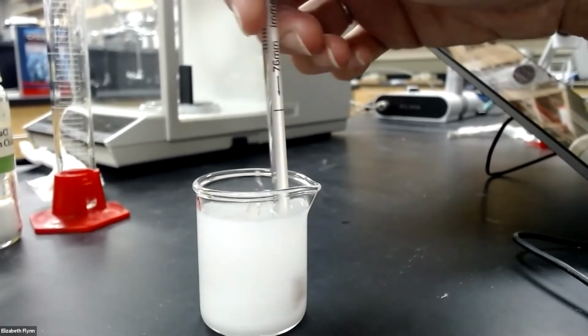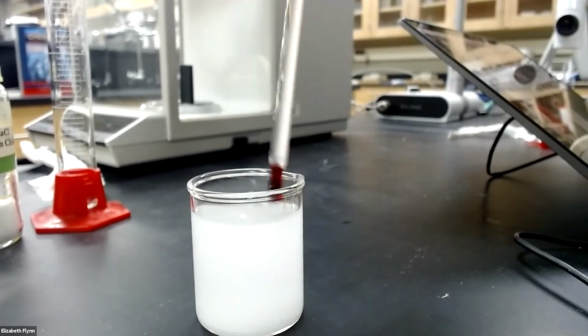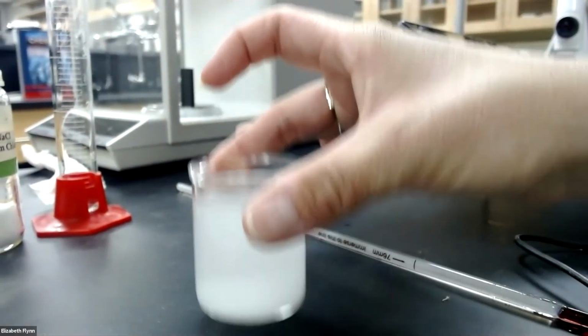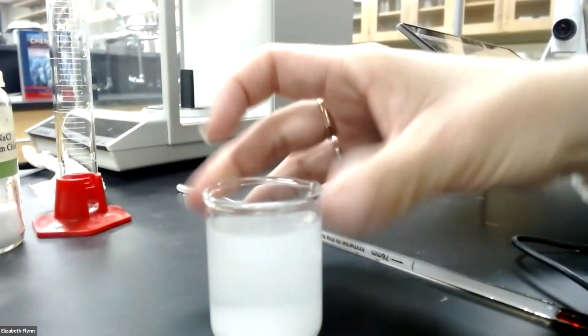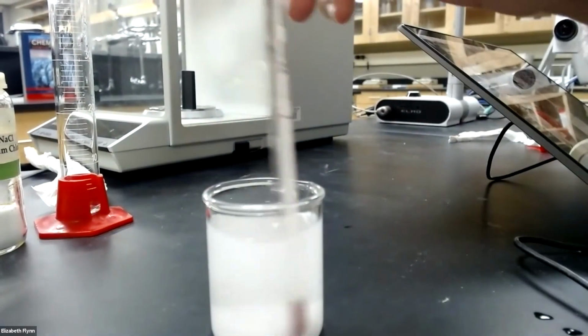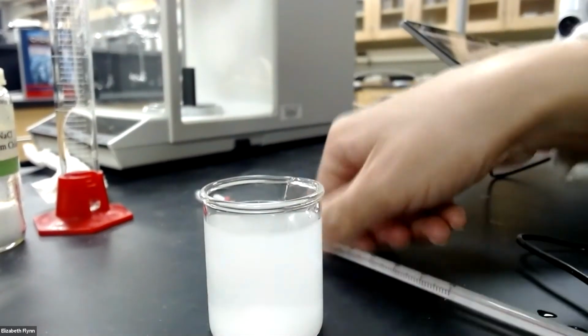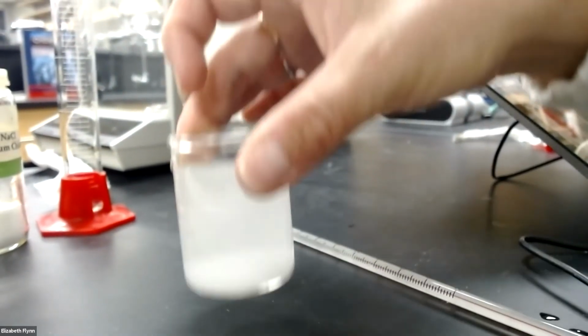And so you're going to keep stirring, but you'll likely need some heat. Just like it says in the procedure, take your beaker and put it in the microwave for 10 seconds. Bring it out, stir it a little bit more. Put it in the microwave again for 10 seconds, right? Beep, bring it back.